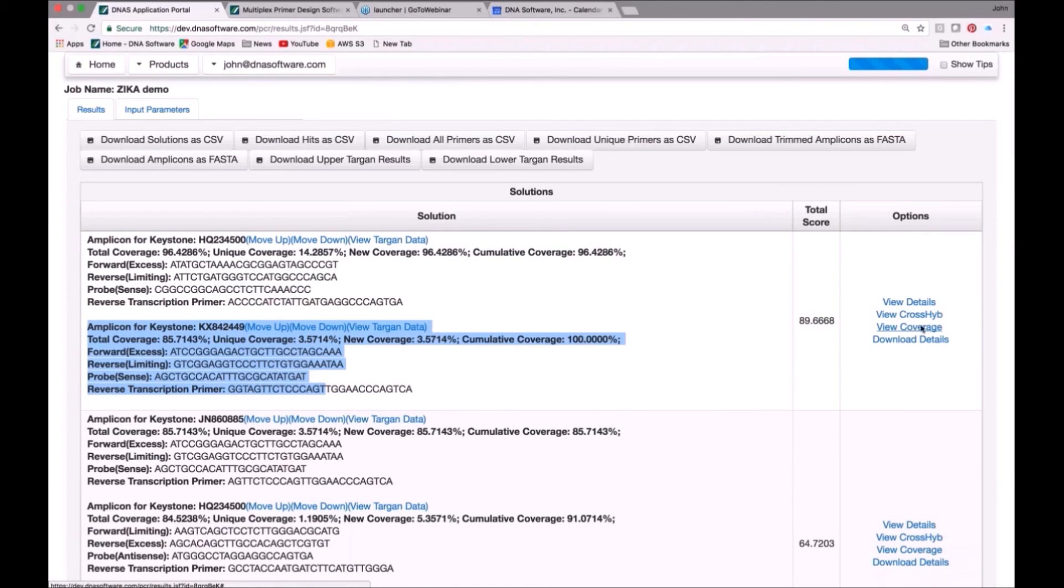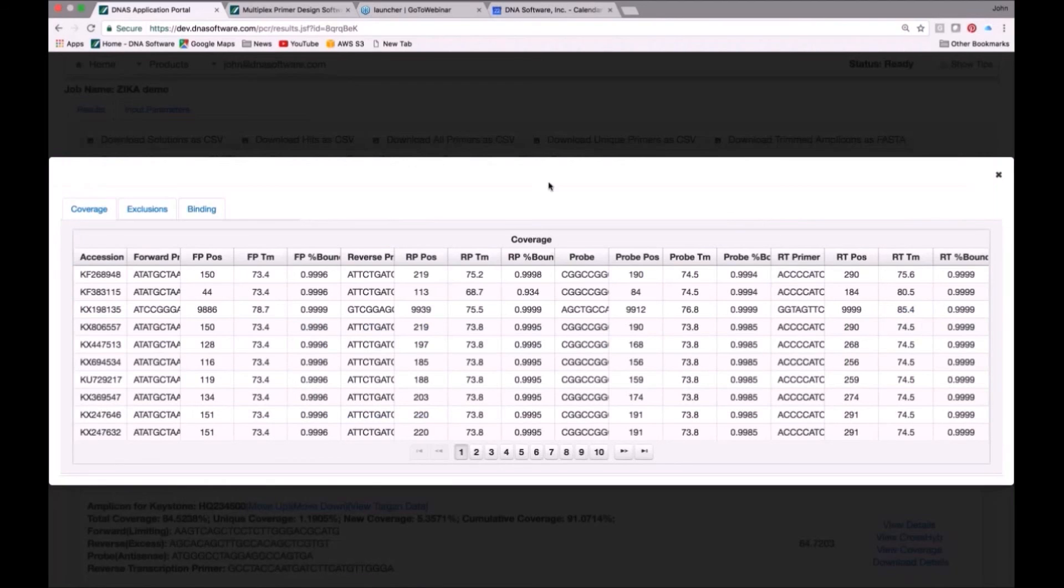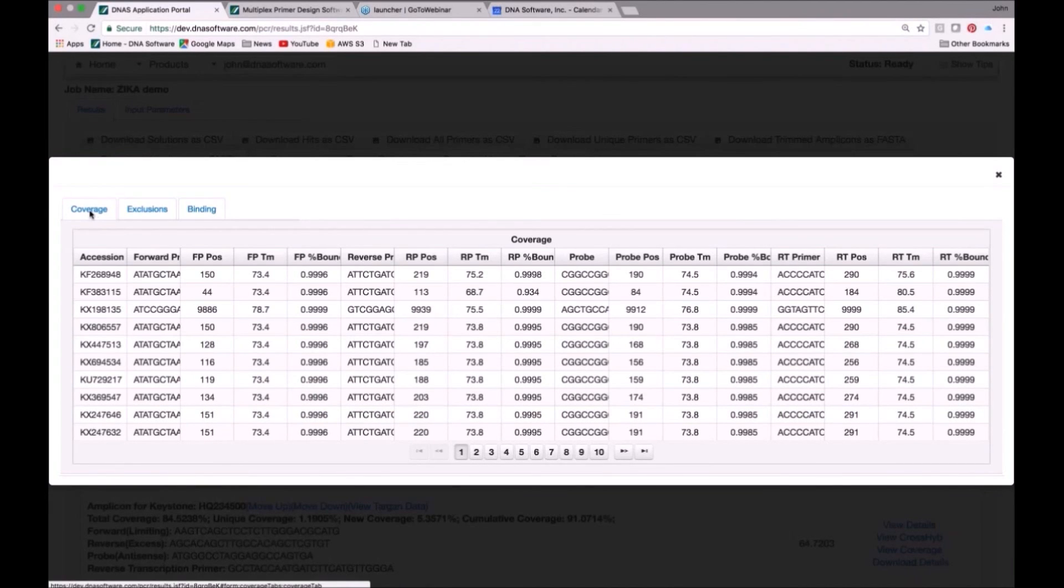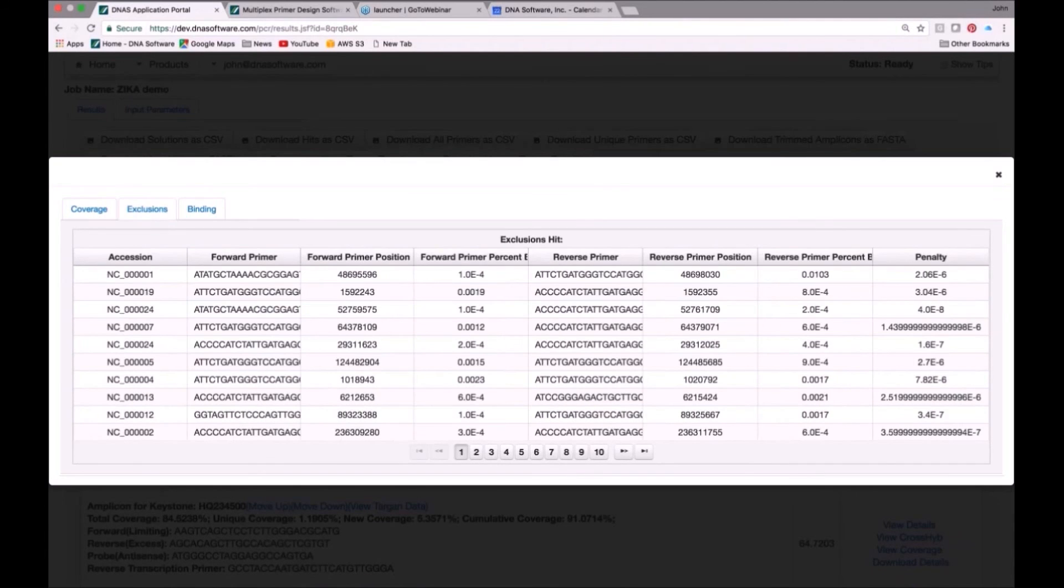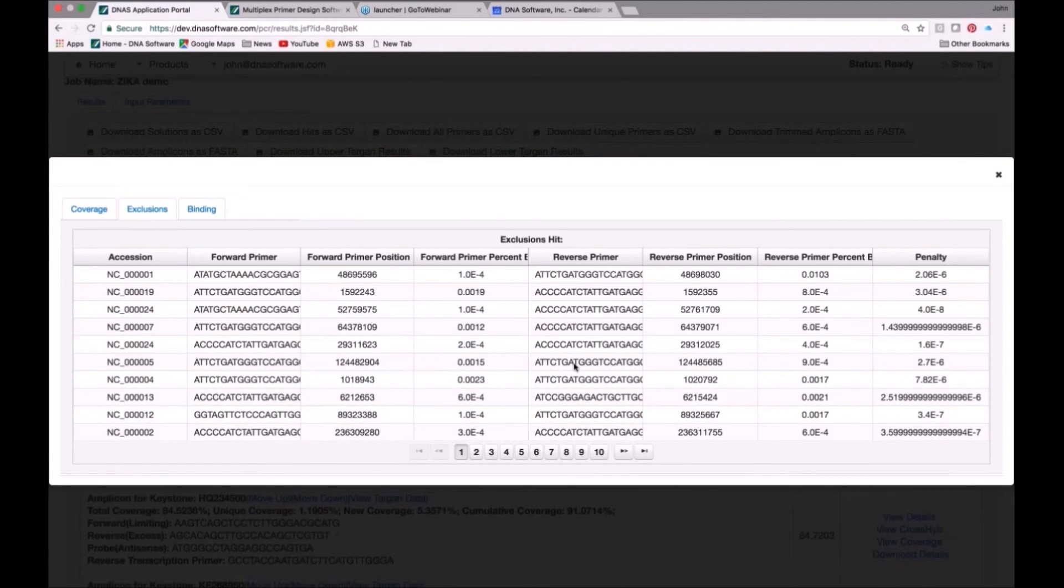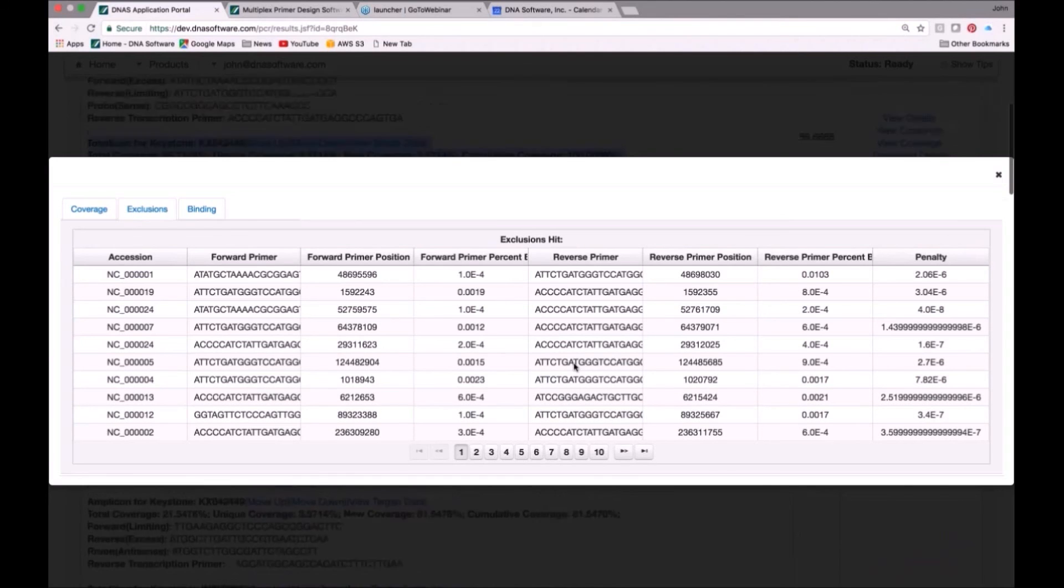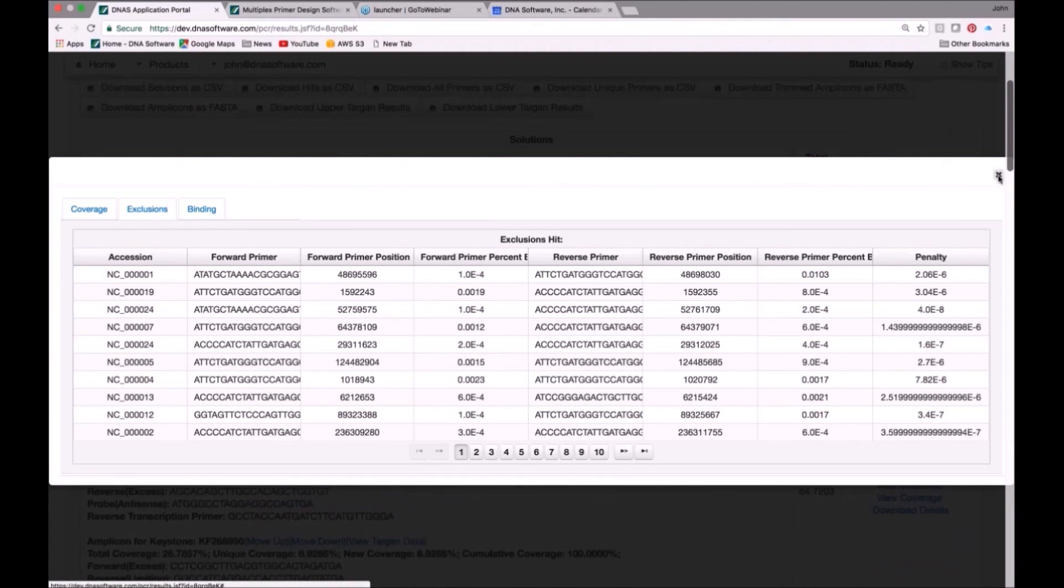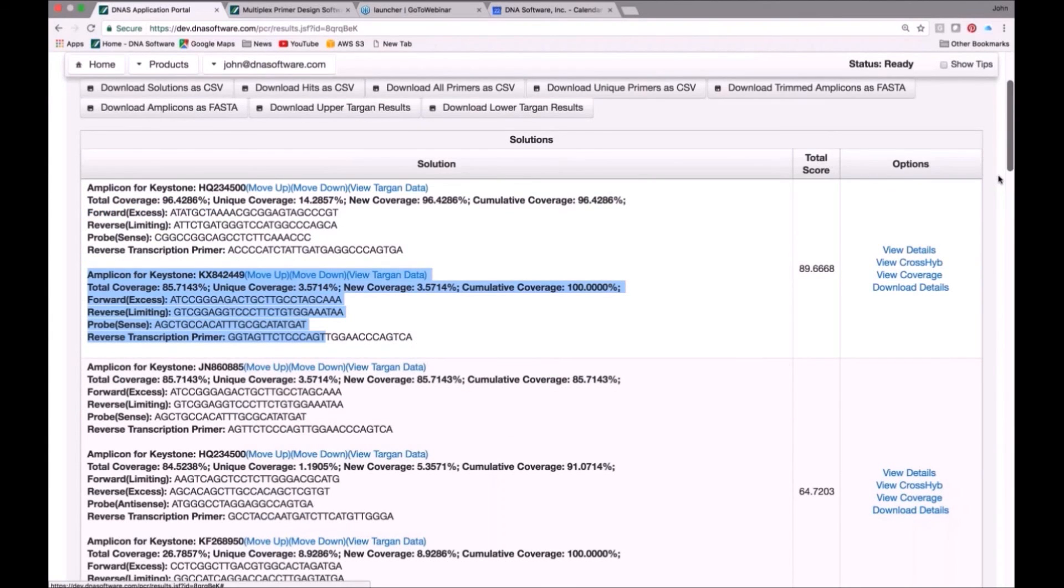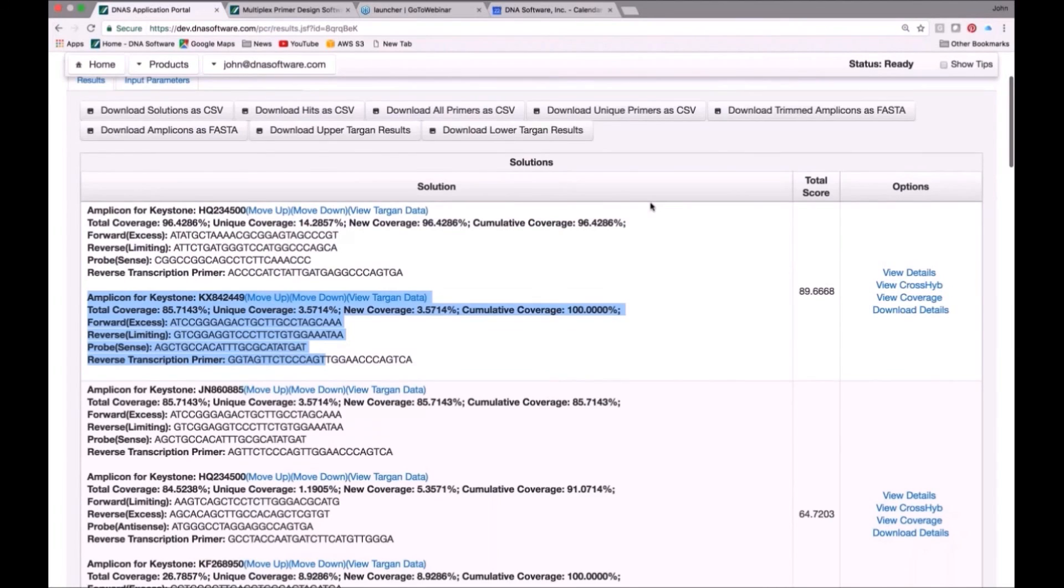You can also look at the coverage here if you want to see how well do these primers cover the different targets. You hit View Coverage link over here, and it takes you to this page. It shows you how the primers cover the inclusivity set. You click over here, you can see how they cover the exclusions that you don't want it to cover, etc. All of the detailed information you can also download as CSV file.